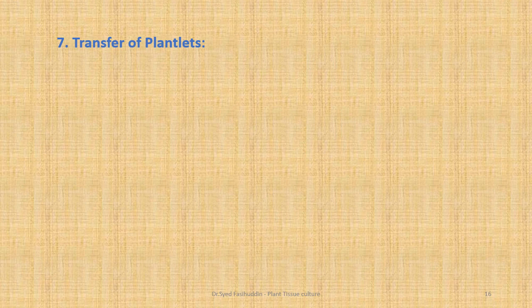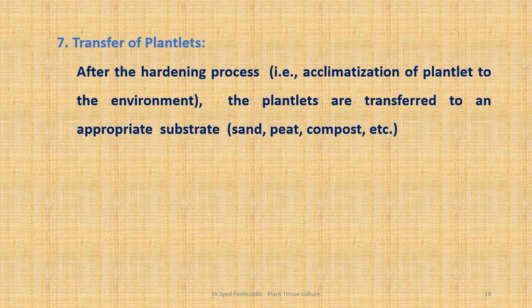Then lastly, transfer of plantlets. After hardening process, the plantlets are transferred to an appropriate substrate like sand, peat, compost, etc.